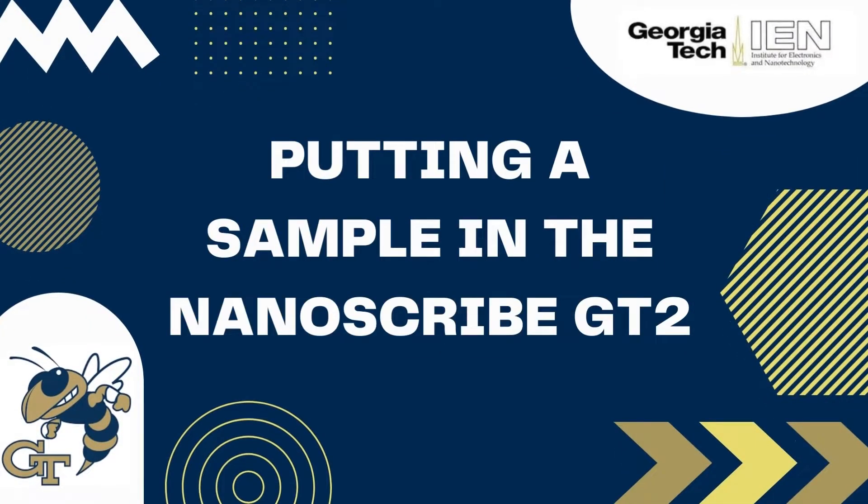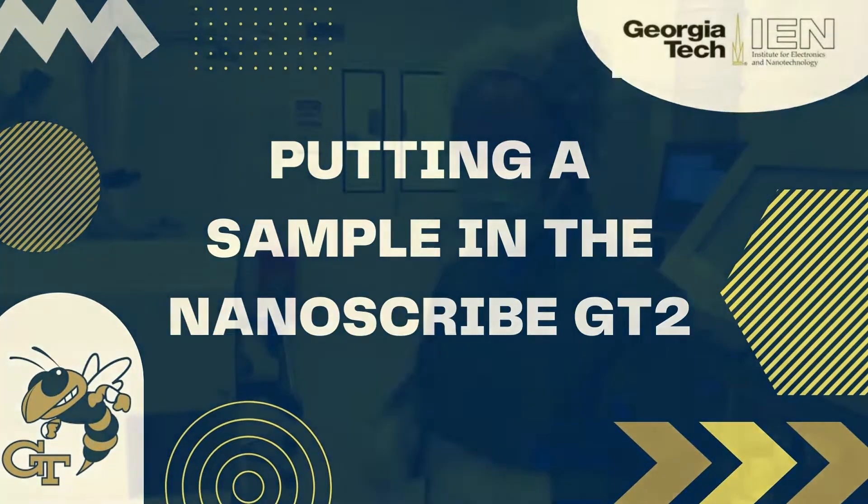Hello, in this video we are going to demonstrate how to put your sample into the NanoScribe GT2.